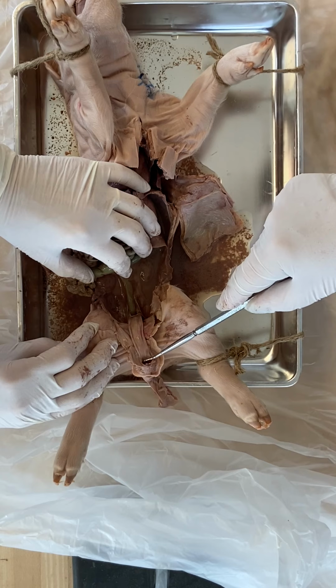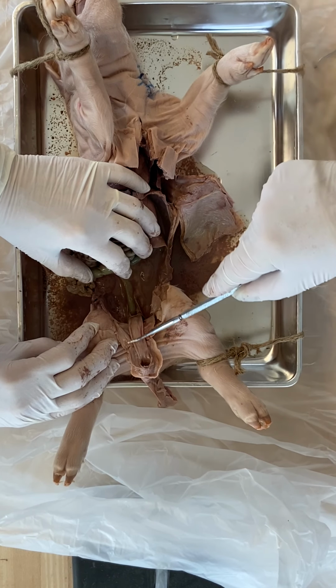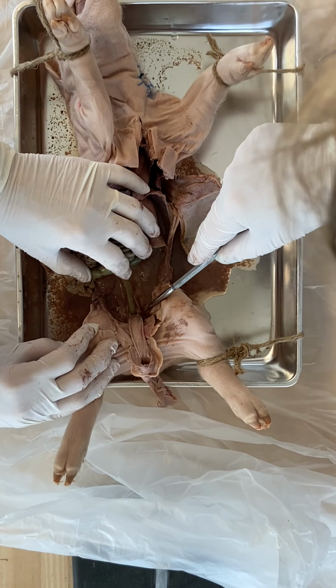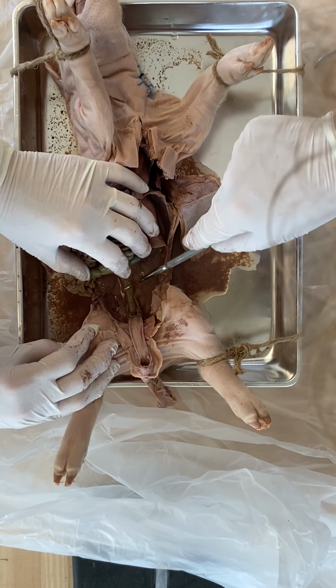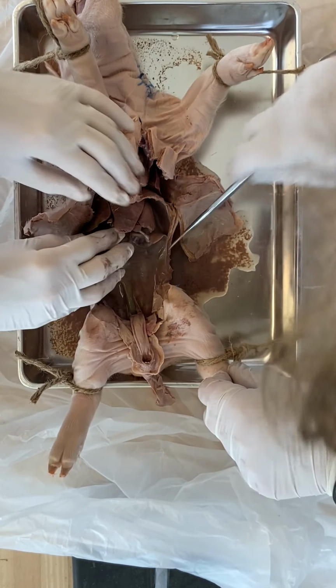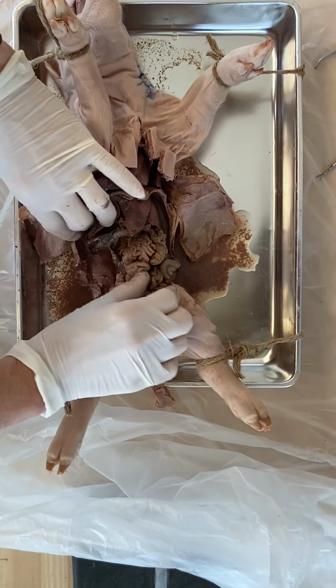This is the bladder here. Well, I didn't puncture it, did I? No, you did a nice job there. You did an excellent job. So here's the bladder coming here, and here's the rectum. And then if we get into the sides here, it's very messy in here. This side was a little bit better.